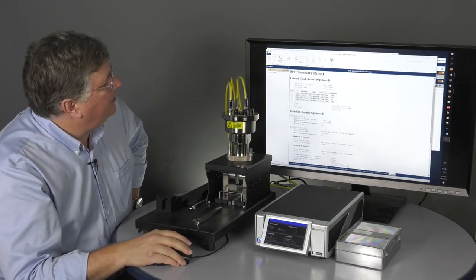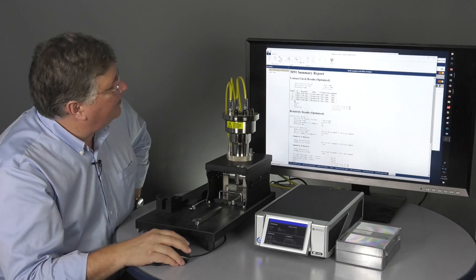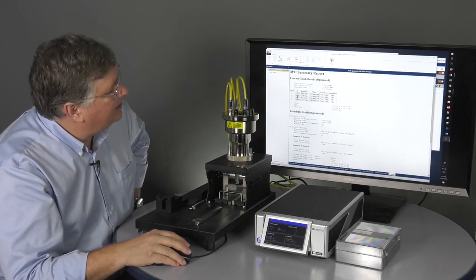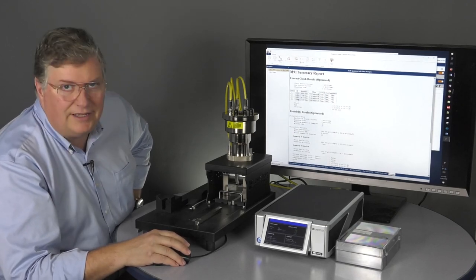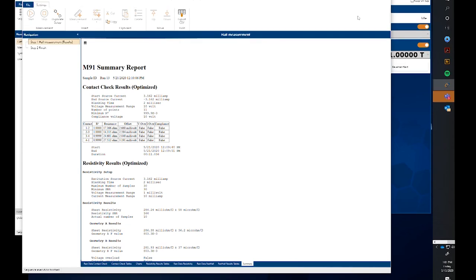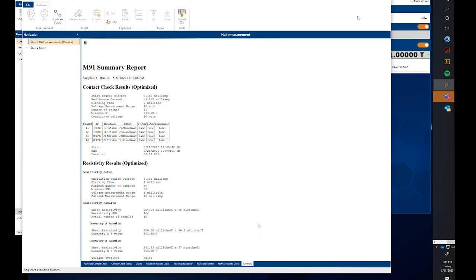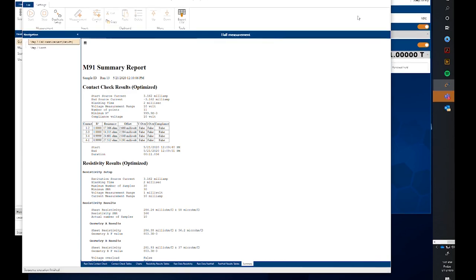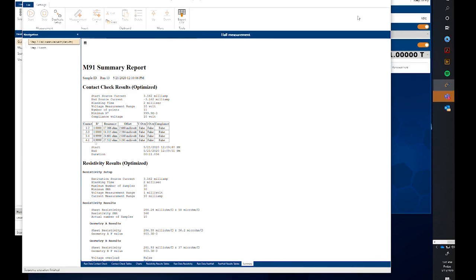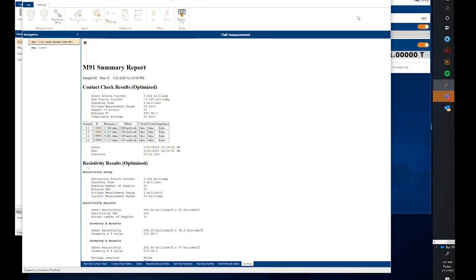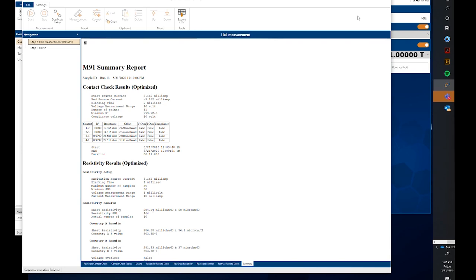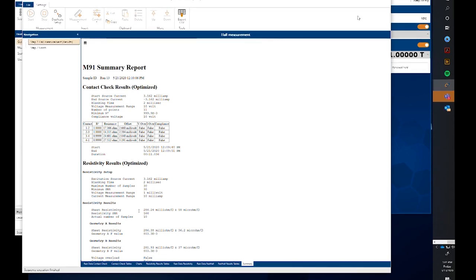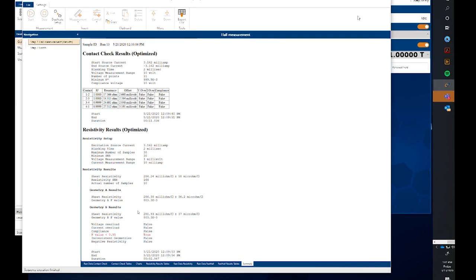So here's the summary report. What we get is a section on the contact check. All four contact checks exceed 0.9999. So they're all passed. Nothing's in compliance or overload. The resistivity section, come down here. The sheet resistivity of 284 milliohms per square. And then we also get a plus or minus 58 micro-ohms. So this is the statistical analysis of the number of samples, which was 10.